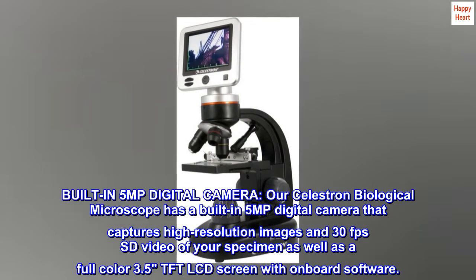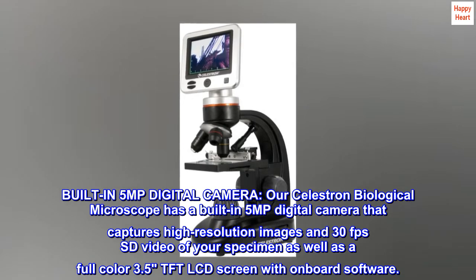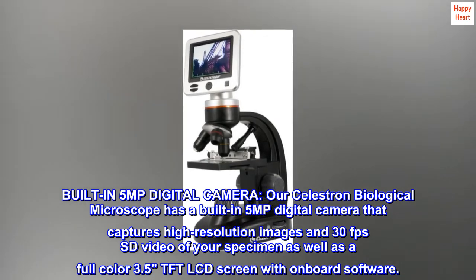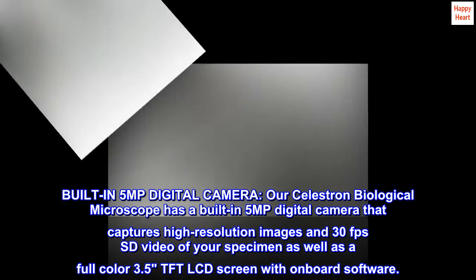Our Celestron Biological Microscope has a built-in 5MP digital camera that captures high-resolution images and 30 frames per second SD video of your specimen, as well as a full-color 3.5-inch TFT LCD screen with onboard software.